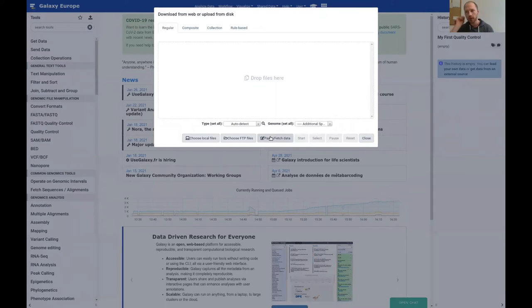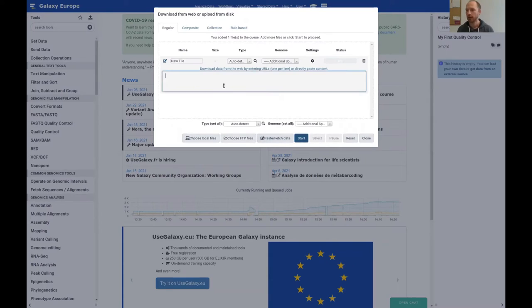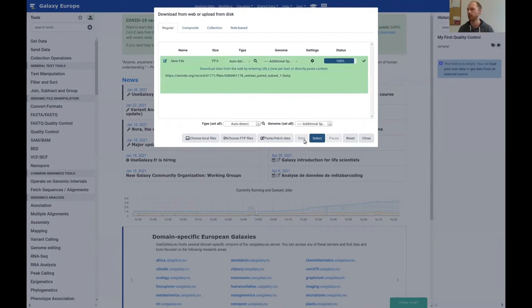Then go to Galaxy. On the left side you will find the 'download from URL or upload files' button. Click on it, then click 'paste and fetch data,' paste the link into the box, and click start.